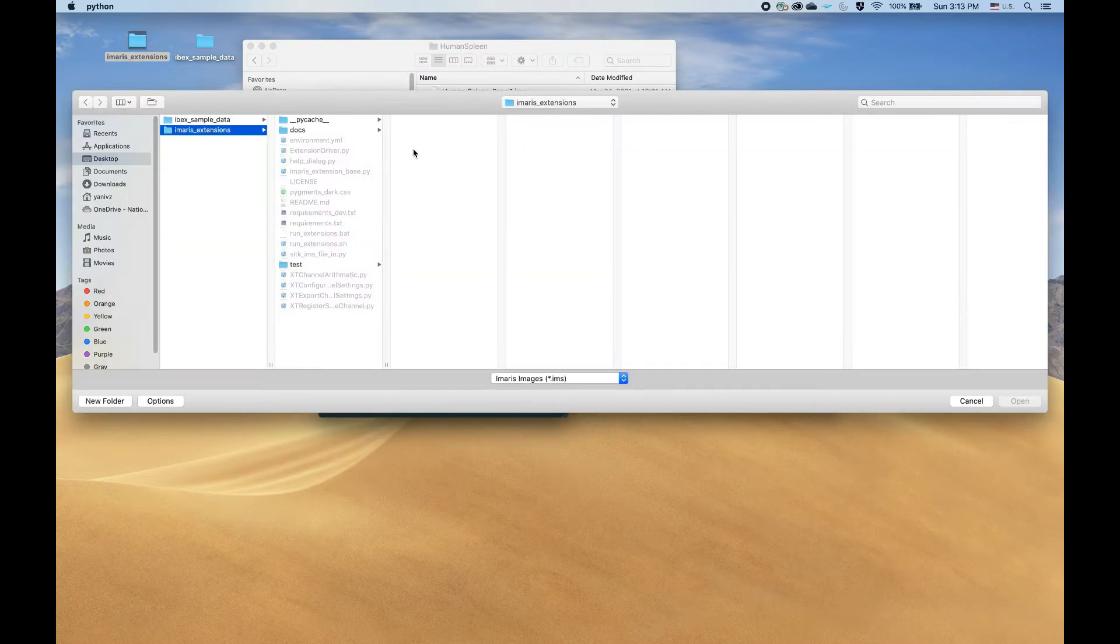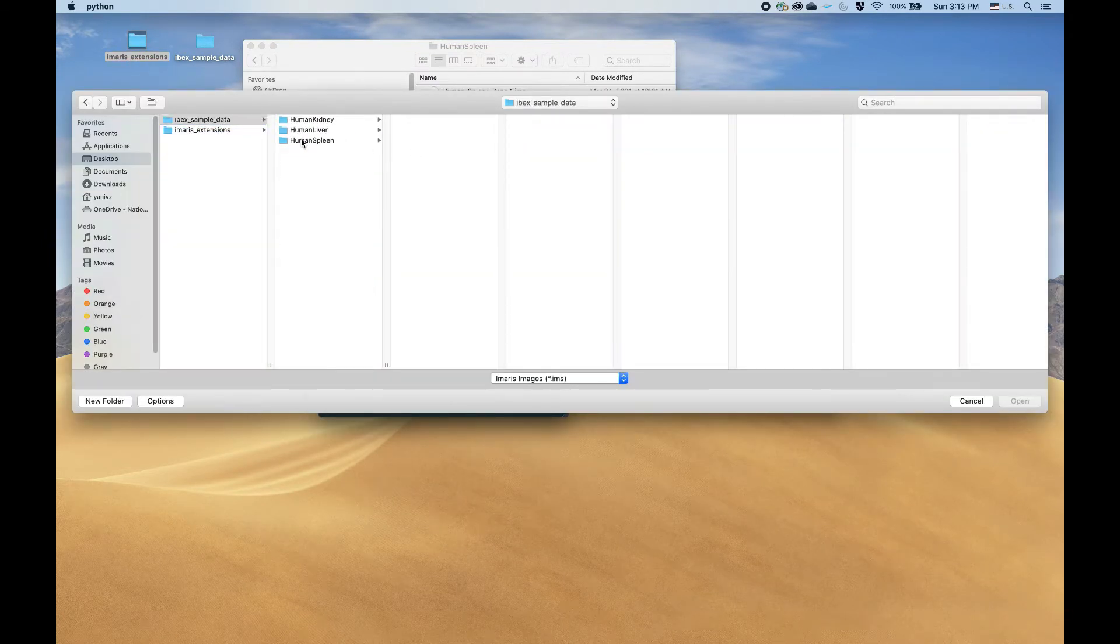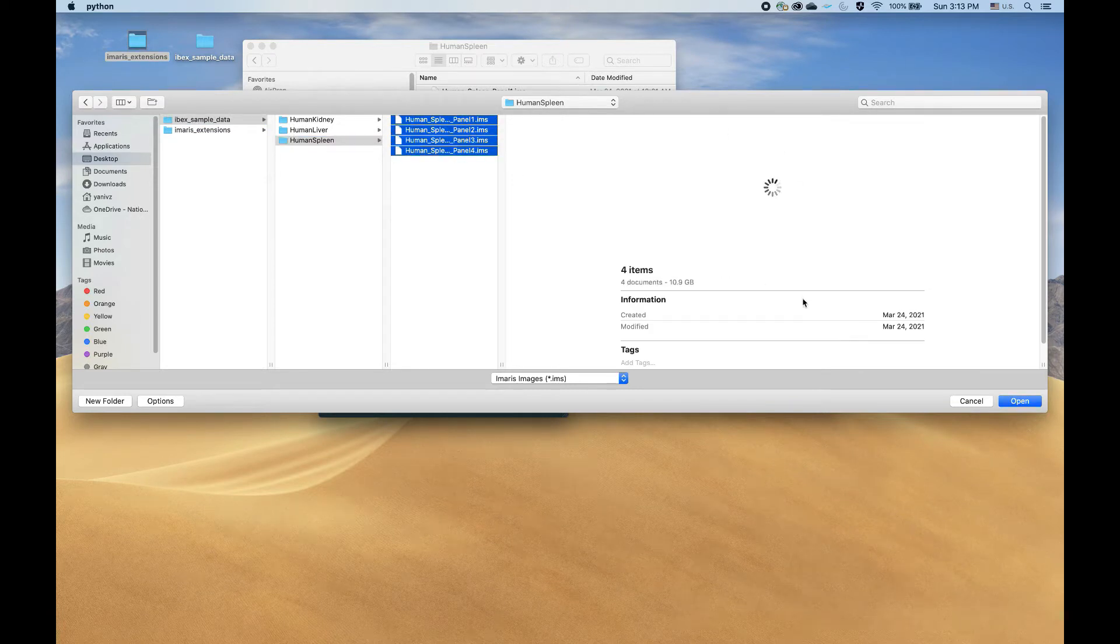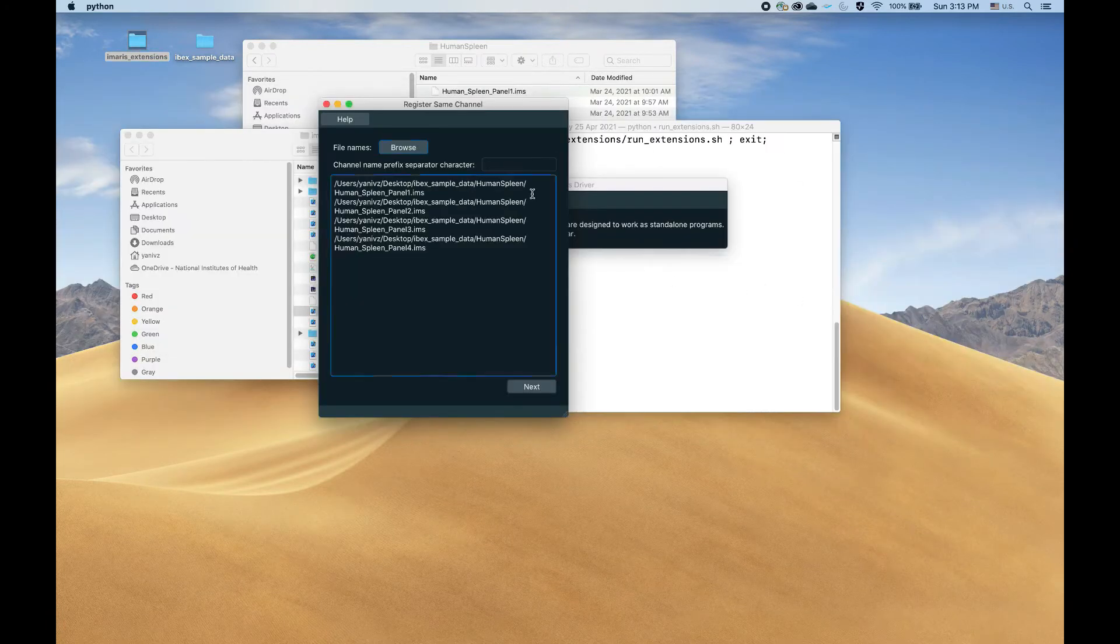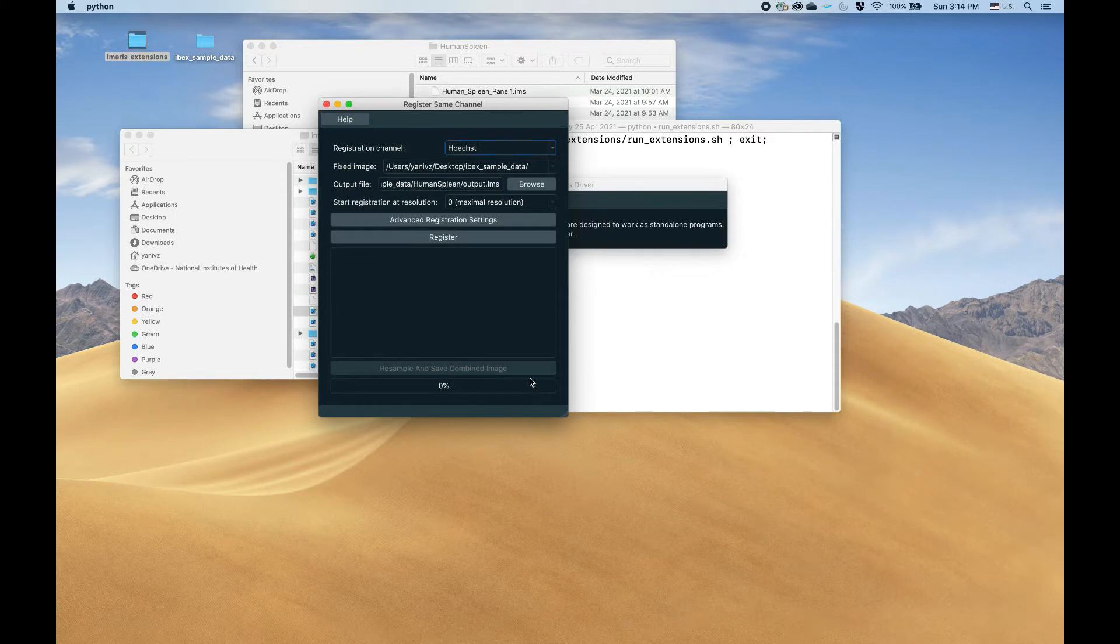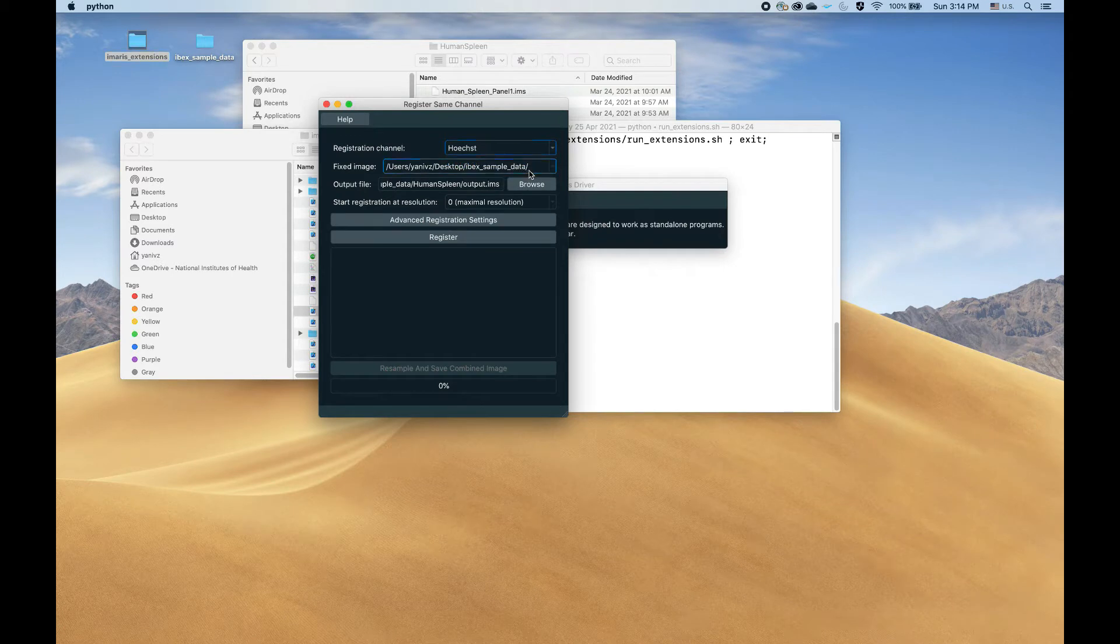Let's select our files. We're going with the human spleen dataset, opening it. As I said earlier, the separator character is colon. Next, and you can see the extension identified that Hoechst is the common channel across everything.